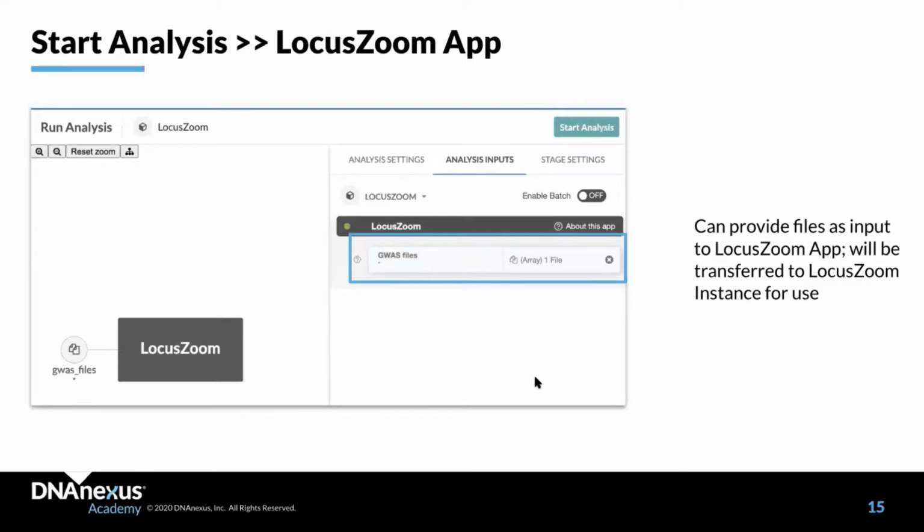LocusZoom normally runs with normal priority, not high priority, meaning that the app could be terminated, but most of the time you're not writing any code. So I never run it on high priority, because it saves money to run it on normal priority, which is the default setting. But in case you need to, for example you are doing a demo or a presentation where you really need to have your app running, then I recommend you run it on high priority.